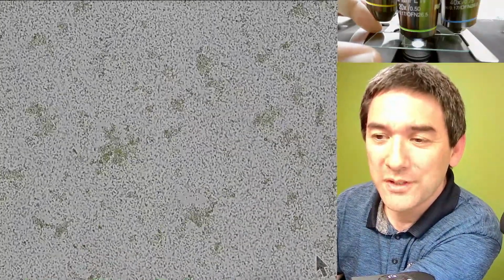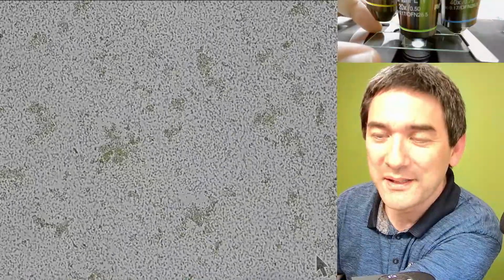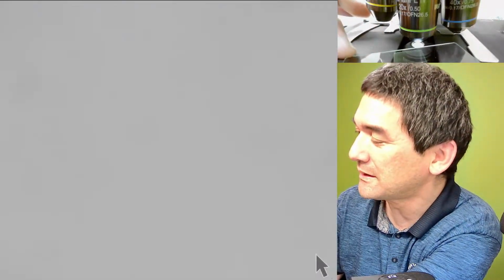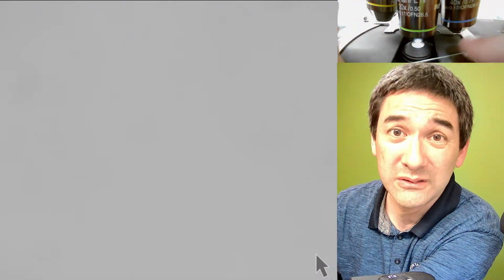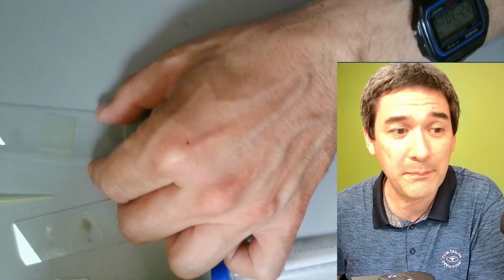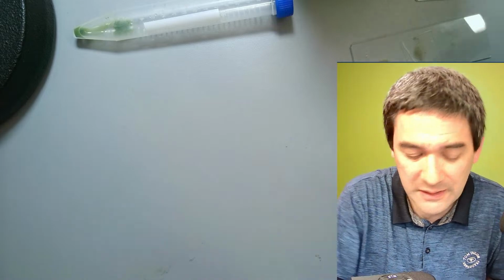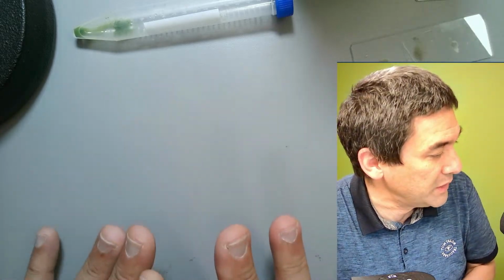I believe just taking care of the pond water samples and keeping them alive and healthy is a big job. It's not so difficult, really. But you have to add some water occasionally. And usually what happens is that there is always a progression happening. So certain organisms are going to disappear, others are going to appear, right? That's a part of the normal thing, and then I occasionally put them again under the microscope.